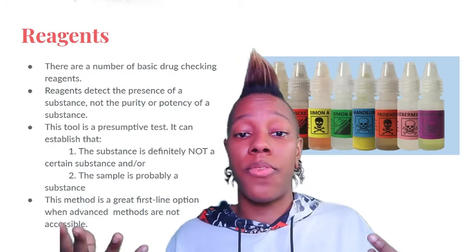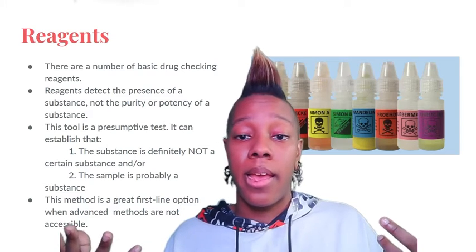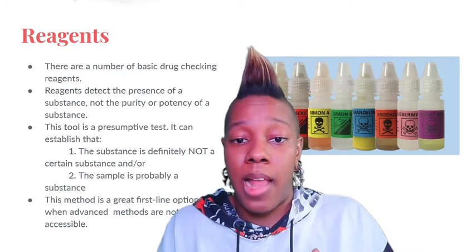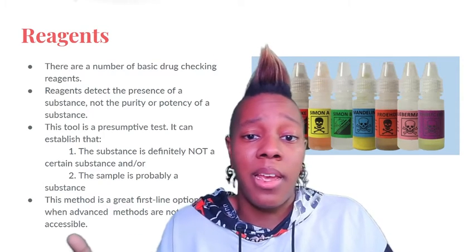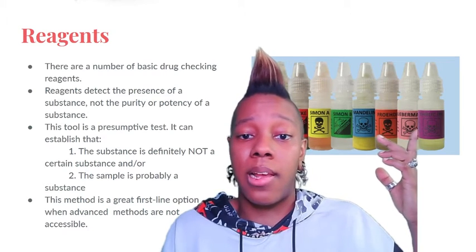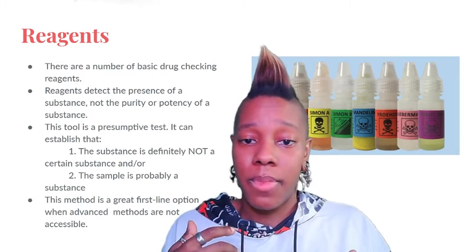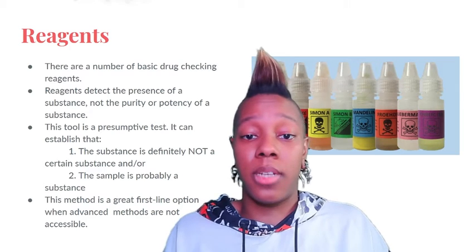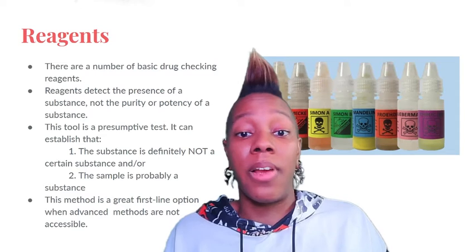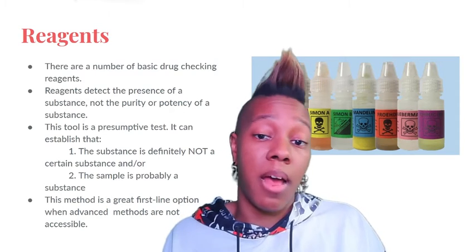And lo and behold, it didn't go green to black, it went purple, a very obvious purple. It wasn't a deep purple that could be construed as black. No, it looked kind of like Ehrlich label purple. I was like, this is signaling that there's a benzofuran in here, and this is most likely the primary compound.